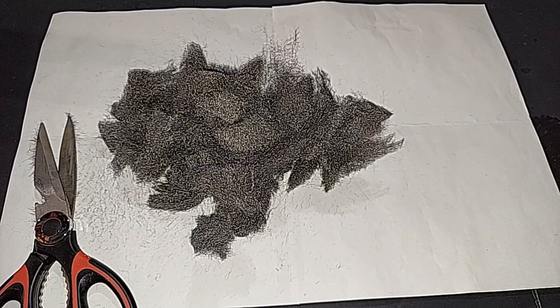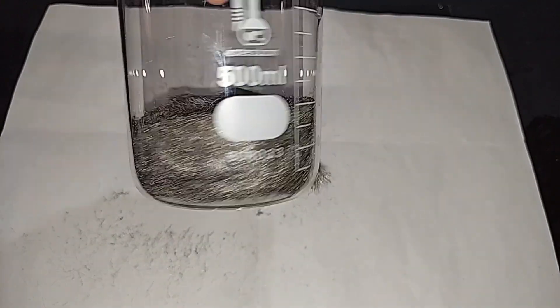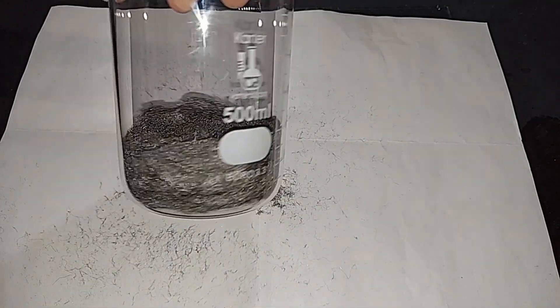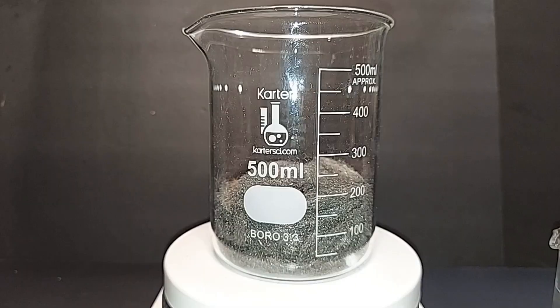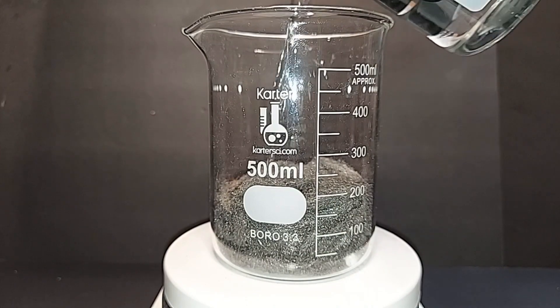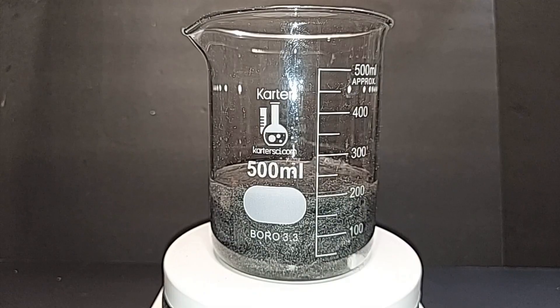The steel wool pile looks big but it will compress down in the beaker. A magnetic stir bar is in there — it's grabbing some of the wool but we'll see if it works. Adding the hydrochloric acid now — it will immediately start breaking down the steel wool even at room temperature. Hydrogen gas is being formed, so do this outside or under a fume hood, as quite a bit is produced when heated.